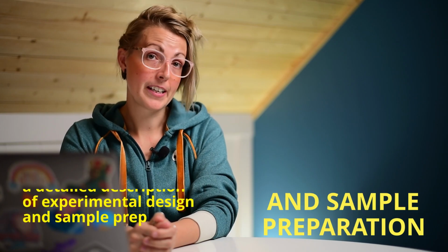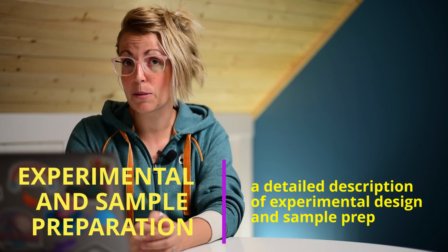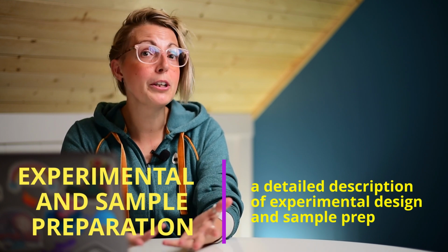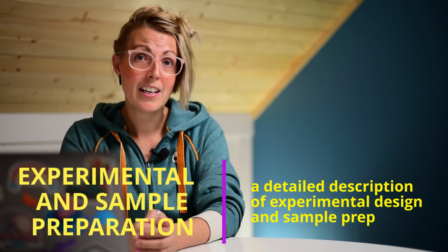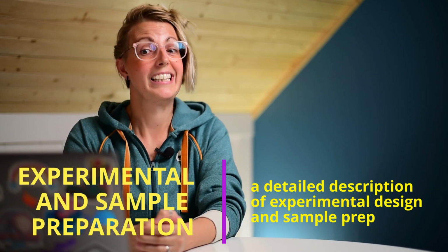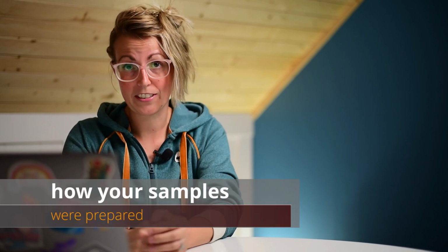So first up, experimental and sample preparation. This is really just a detailed description of your experimental design and your sample preparation, normally what you'd put in your materials and methods. However, generally in flow cytometry papers, this is quite lacking and needs a lot more detail. So when you're writing up this part, make sure you include details on how your samples are prepared.